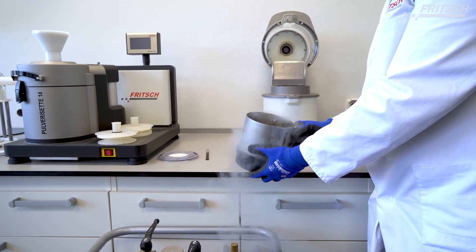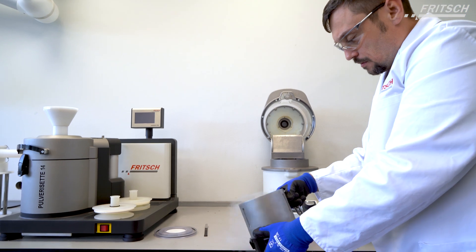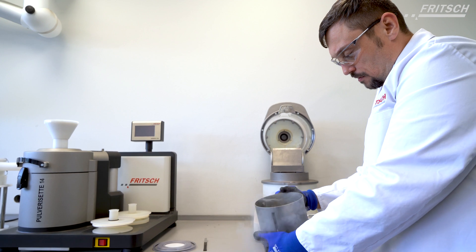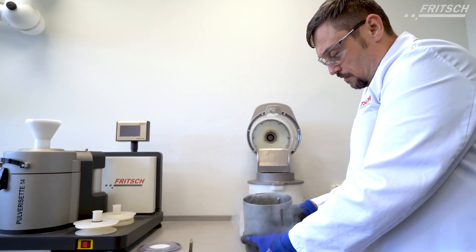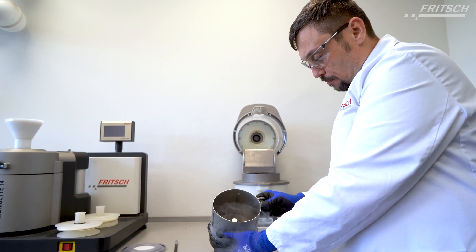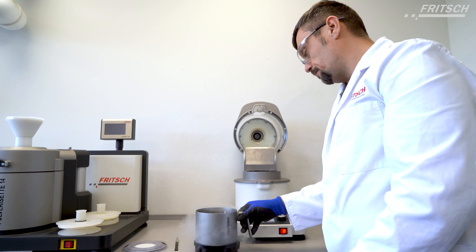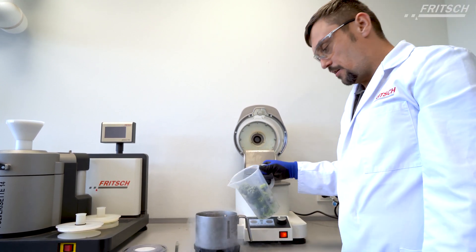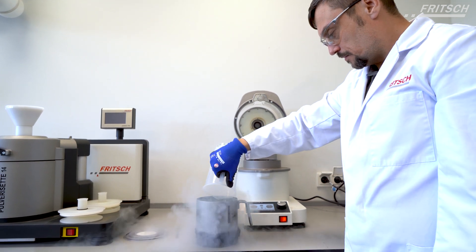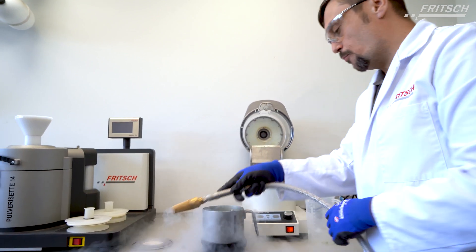This procedure is for pre-cooling the whole bowl to avoid letting the sample freeze on the bottom. Now we can add the sample inside and flood it again with more liquid nitrogen.